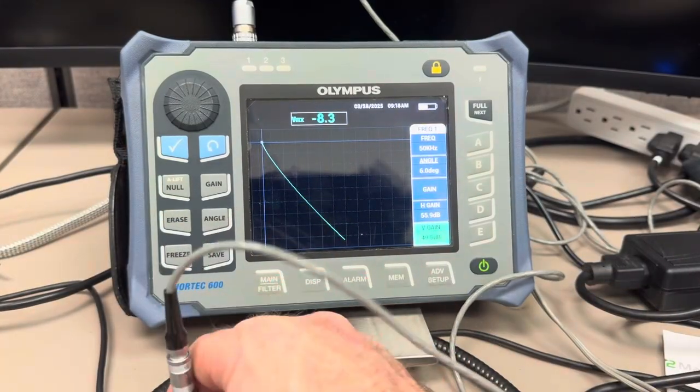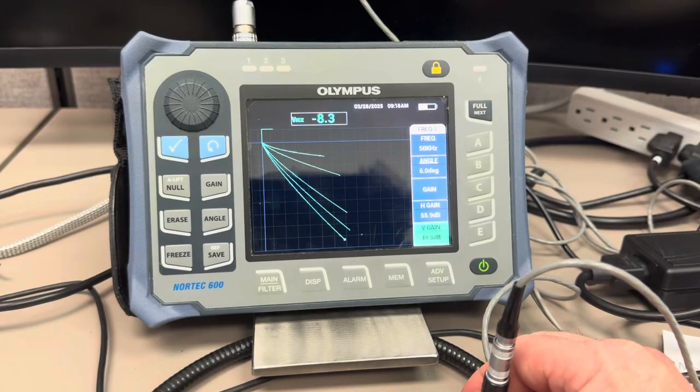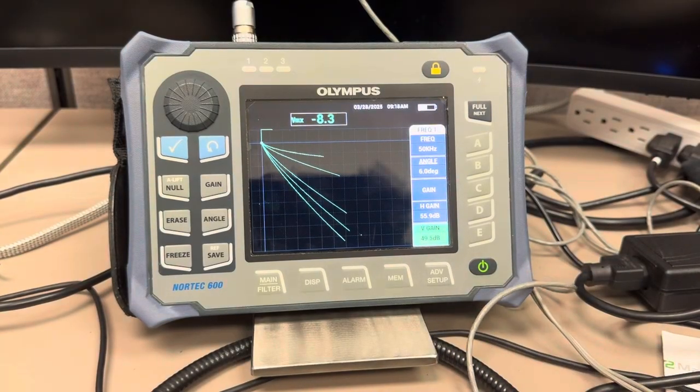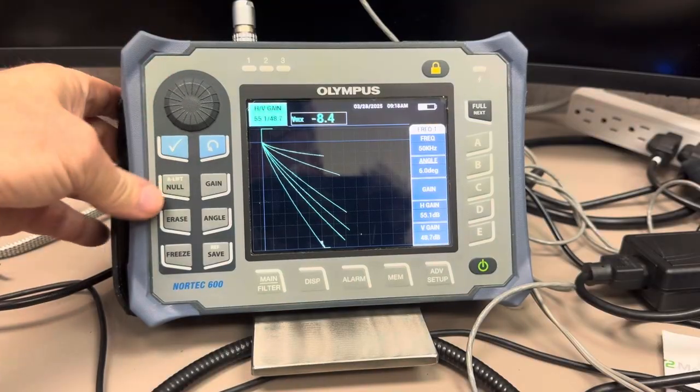Now we got ferrite. 304 copper nickel. Magnesium. 7075 T6. 7075 zero. Copper. I brought it a little too far. How about that? So now you have the conductivity curve.